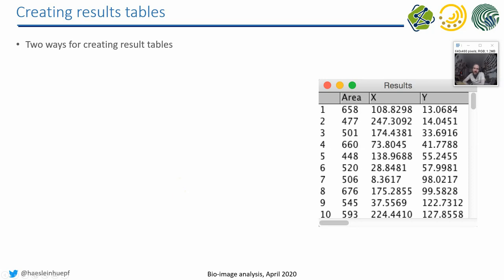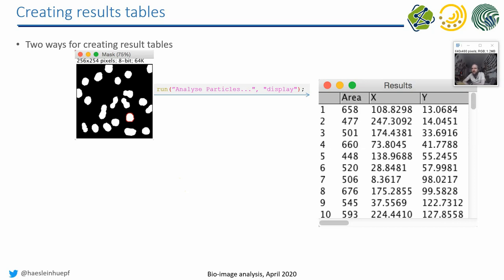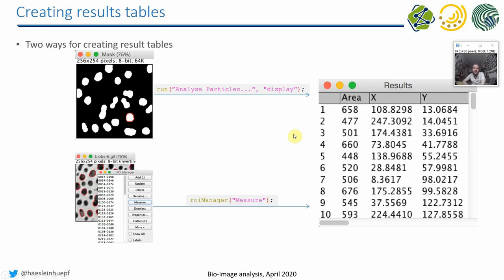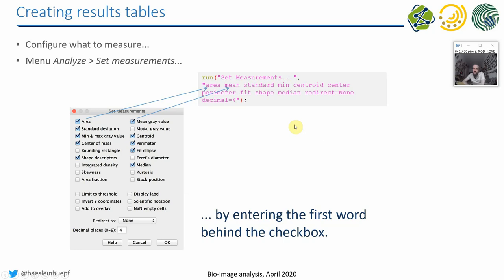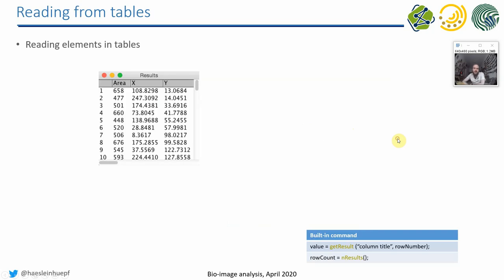There are two ways for creating results tables. You have done both, I assume. So the first one is running the particle analyzer and checking the checkbox for display results. And this is how the corresponding ImageJ macro code for this looks like. Furthermore, you can also from the ROI manager click on measure and create a results table like that. It basically should result in the same results table. And if you want to change the columns which are in this results table made by the measurement, either the particle analyzer or the ROI manager, you call this set measurements method. And you can also look at the recorder and what it records in order to, for example, measure the area. And we have done that last week already, right?